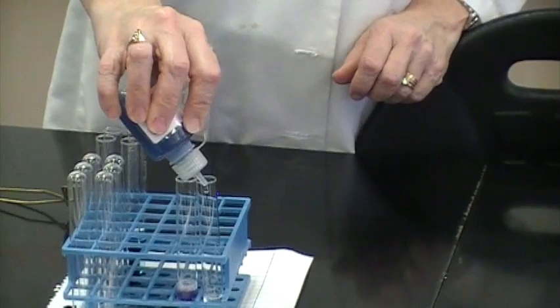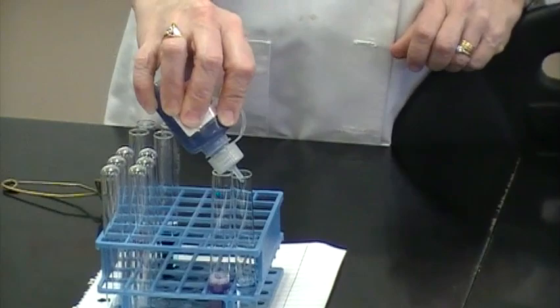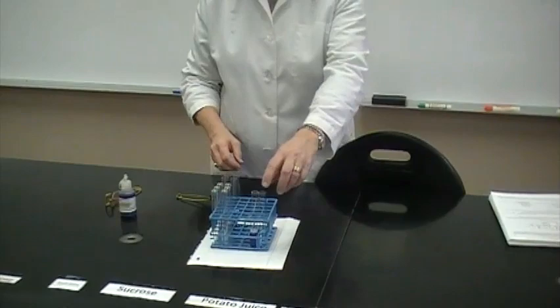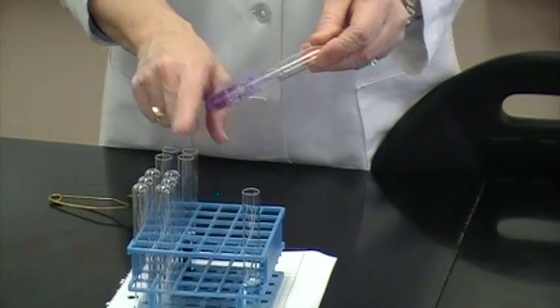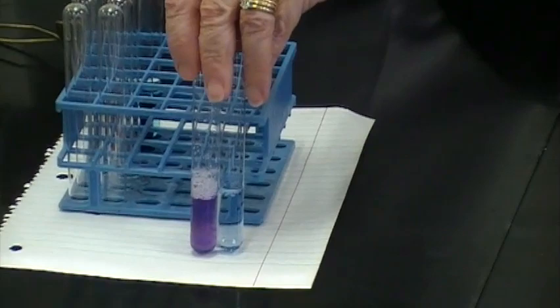A control is always used so that we have that for comparison and reference back to what a non-positive test looks like. We mix each test tube thoroughly. And again, when you compare each test solution to the control, you can see the color change is obvious.